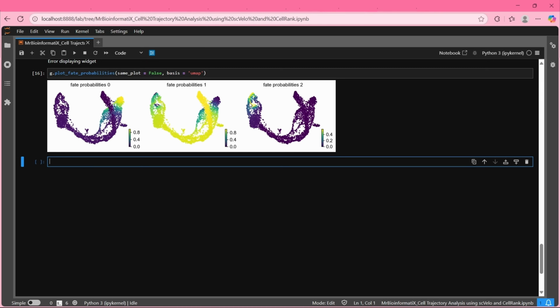It's probably a minor lineage or rare terminal state. So fate 0, alpha: the yellow high-probability region is concentrated on the alpha cluster. Those cells are strongly predicted to become alpha cells. Surrounding areas are greenish, moderate probability, meaning some nearby cells are partially biased toward alpha, but not fully committed.